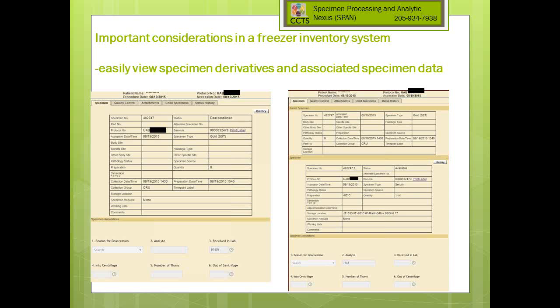If you drill down a little bit more, this is taking one particular encounter, and in Encore, in this case, the lab is blinded to the name of the patient, so you can't see it there, but it's behind the scenes. So for study staff, if they want to go in and see it, they can know exactly who that belongs to. But you can collect information about the specimen. Here's the collection time, the preparation time. If it's actually a tissue, there's a lot of information here you can store about the tissue related to that particular sample. The specimen type is here.